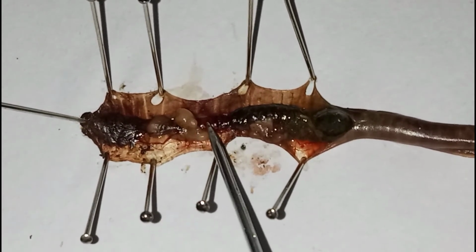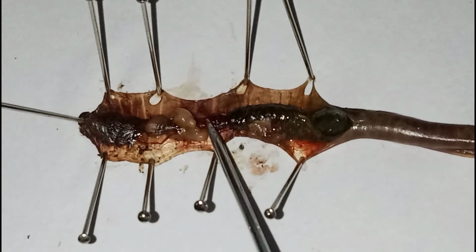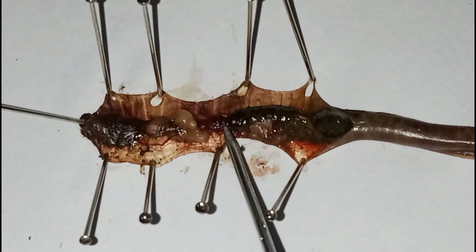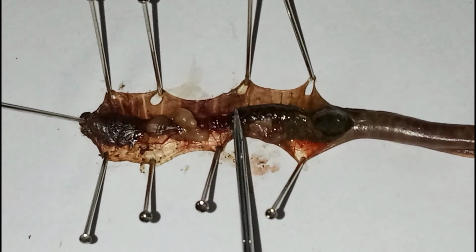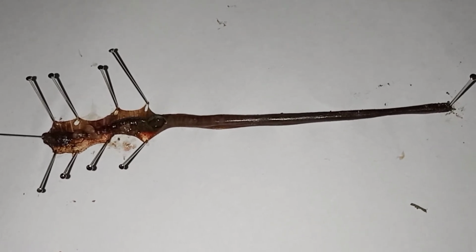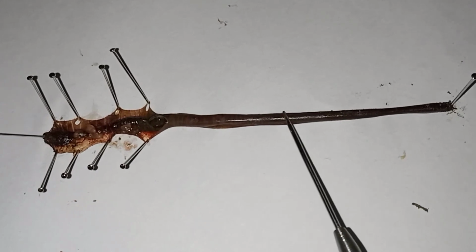After the esophagus, the food will enter the crop and it will pass to the gizzard and to the intestine. The intestine of the earthworm extends until its posterior end, or the posterior region.